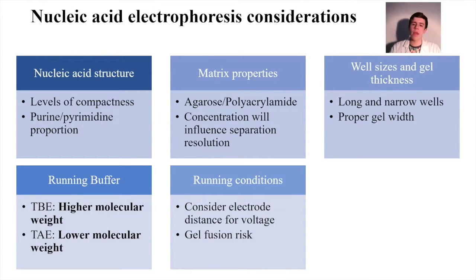Running conditions. The voltage used for running the analysis is dependent on the distance between the electrodes of the device and the average size of the samples to be separated. It is important to run the analysis before the gel fuses.